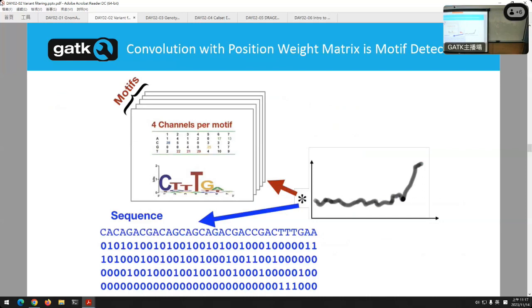And you can do that many, many times, over and over again. And so we do something called convolution. Convolution is a mathematical term which means a blend. A convolution is a blending of different functions. So we're basically taking those motifs. And again, this is very high level. You blend these things across many thousands of motifs. You're trying to have the computer learn a model of what happens in the genome. Don't worry if you don't understand it. I can see people saying, I don't get it. We're going to get to the fun part soon. So we're going to have it learn all about the sequence and what the changes look like.